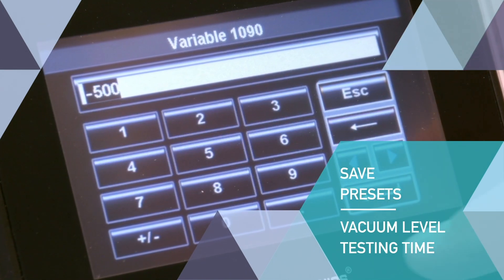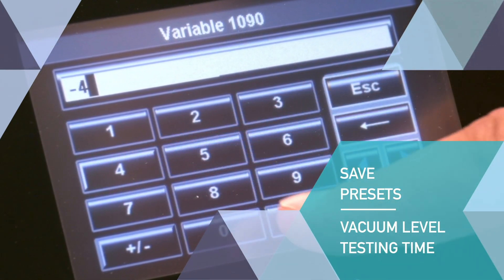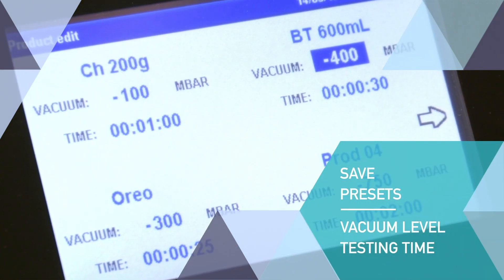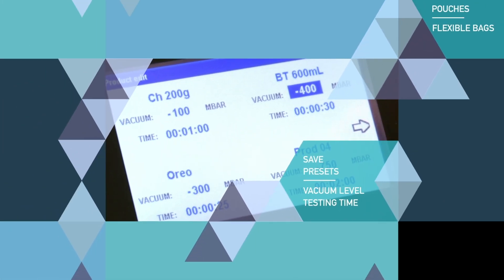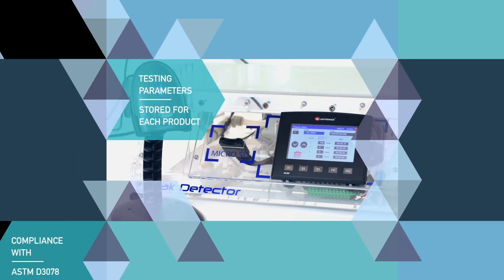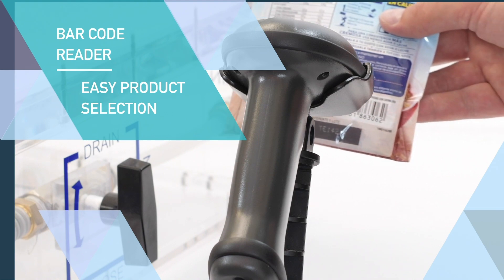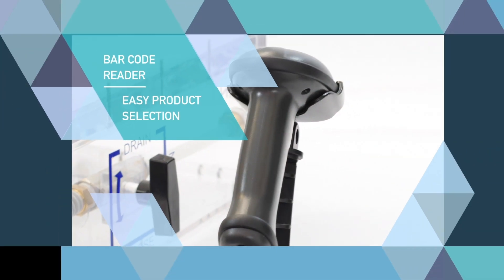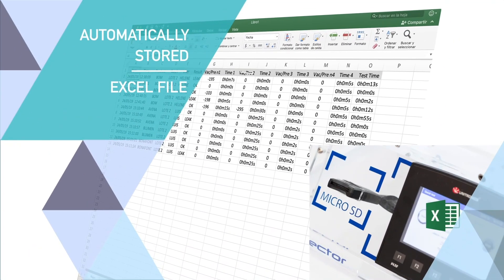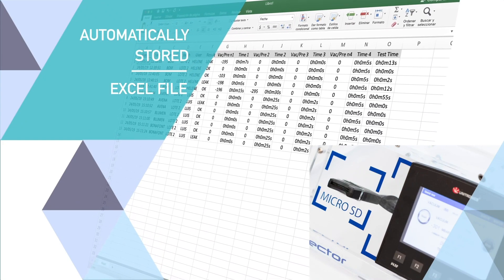The CDV allows the operator to determine and save presets such as vacuum level and testing time. Testing parameters can be stored in memory for each type of product. A barcode reader allows the operator to easily select the right testing parameters. Test results can be printed and automatically stored in an Excel file on an SD card.